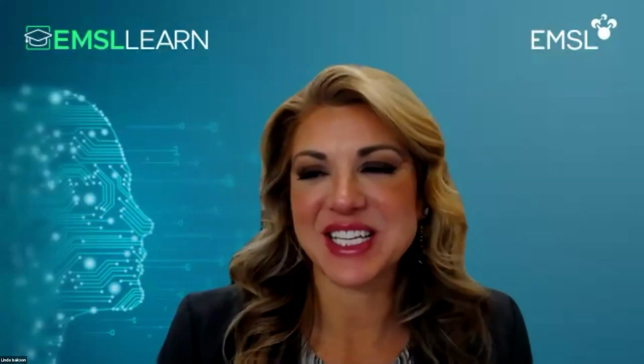Great, thank you. So this next question is for McKenna. Is there a limit to how many files you can download from the data portal at once? Yeah, so there's currently not a limit on the number of files. There is a size limit. I believe it's 100 gigabytes, but if you need to download more than that, you can do it using Globus. Like I mentioned, Globus is really good for moving large amounts of data between sites. So that's the preferred way to move those really large downloads.